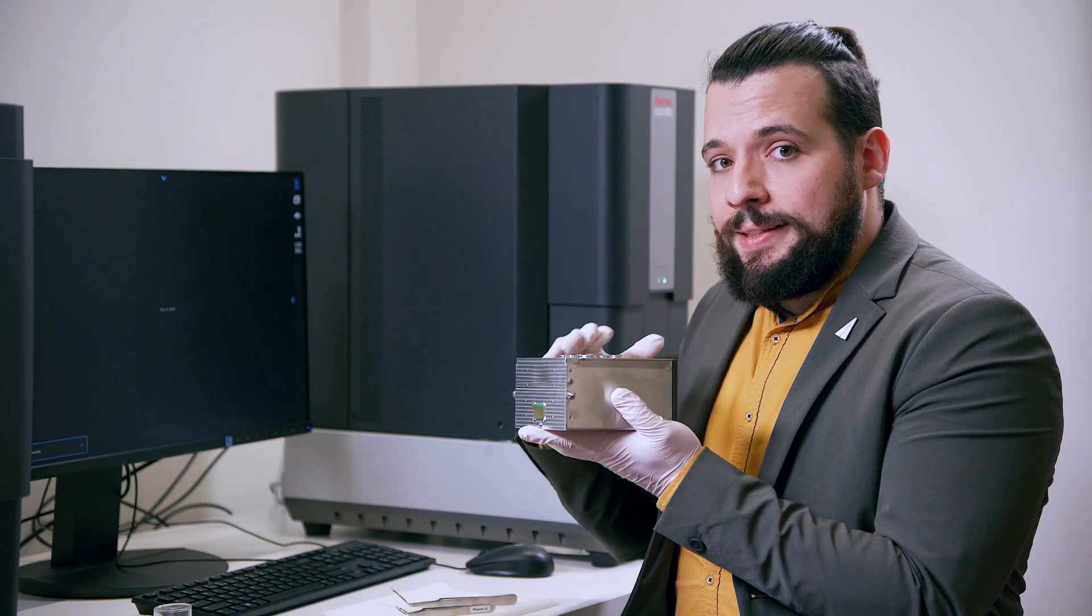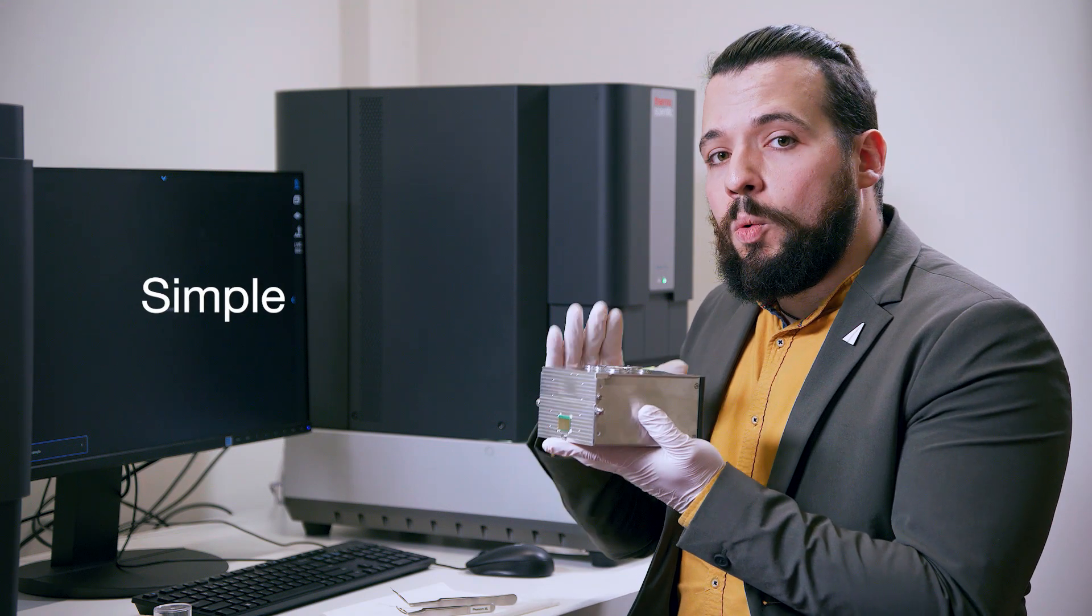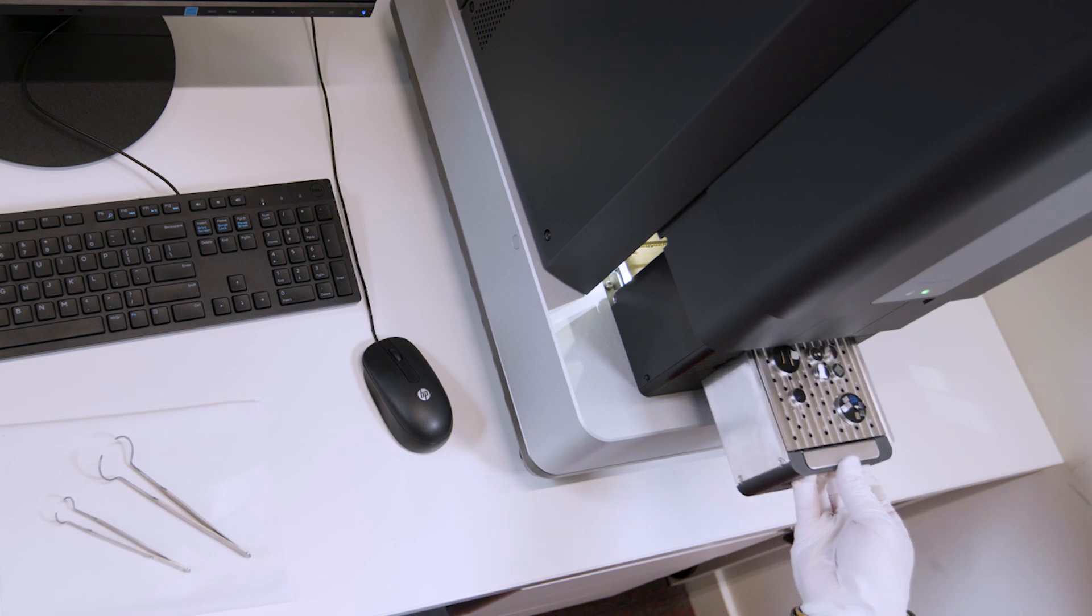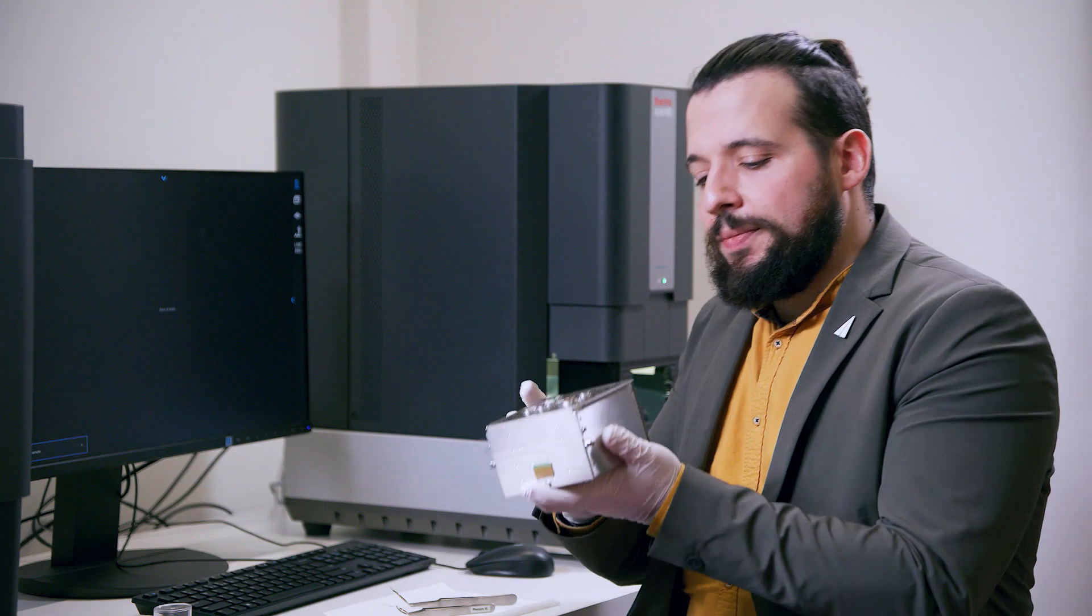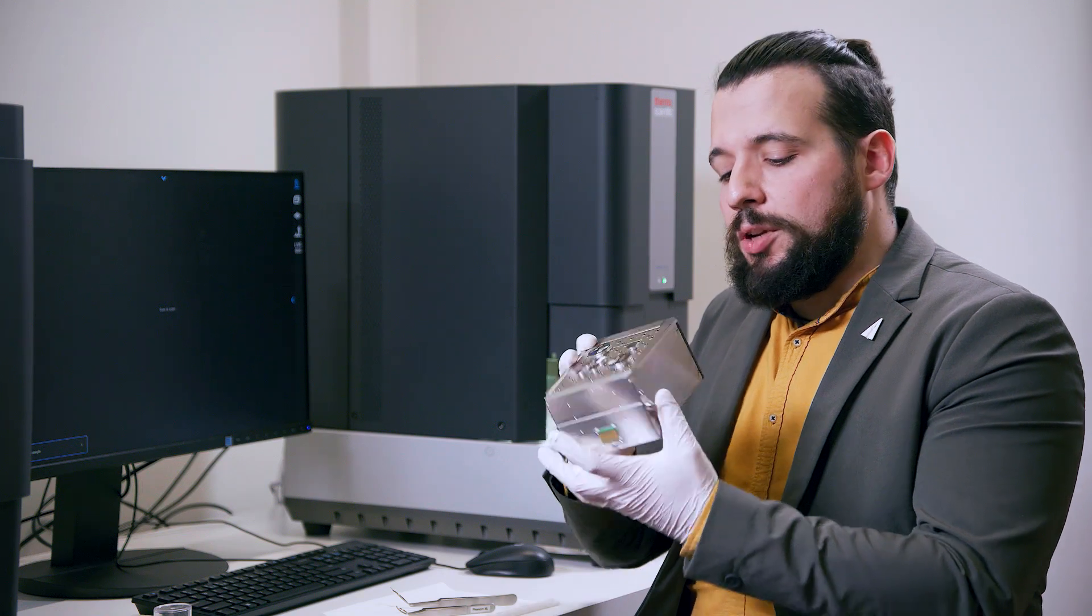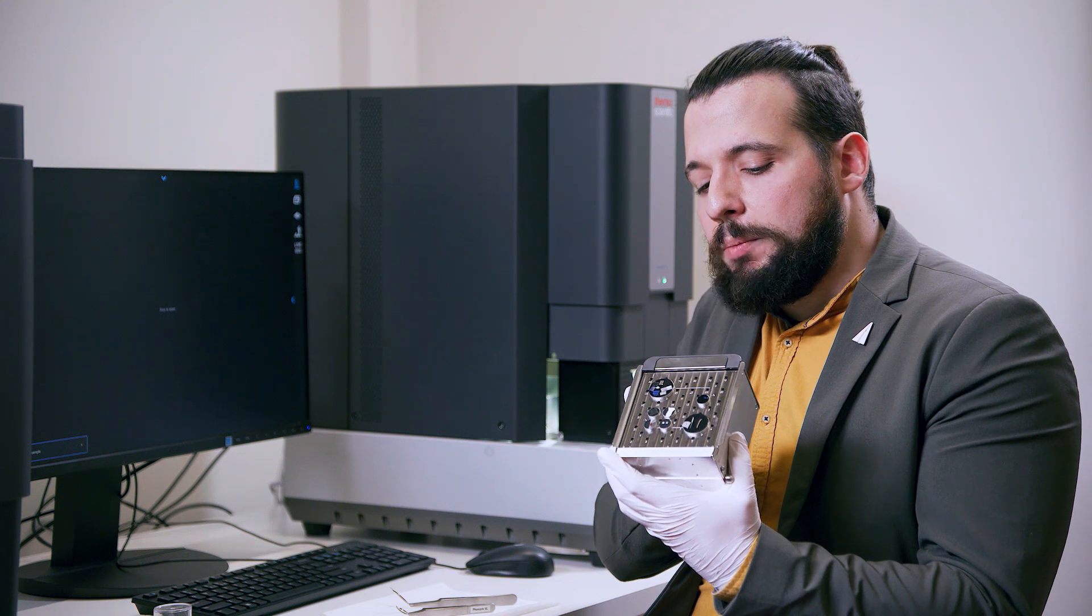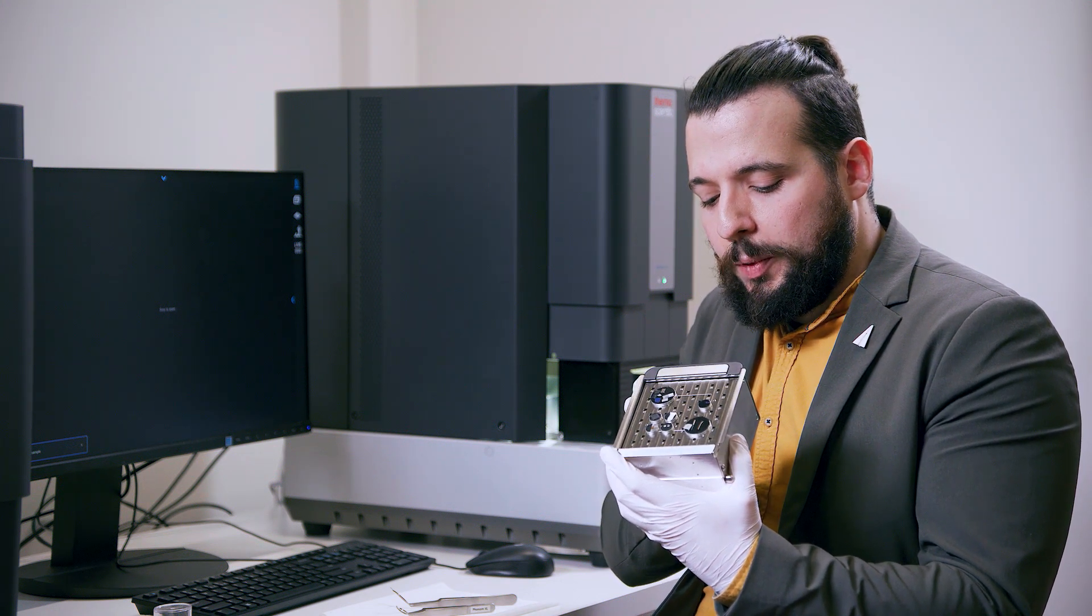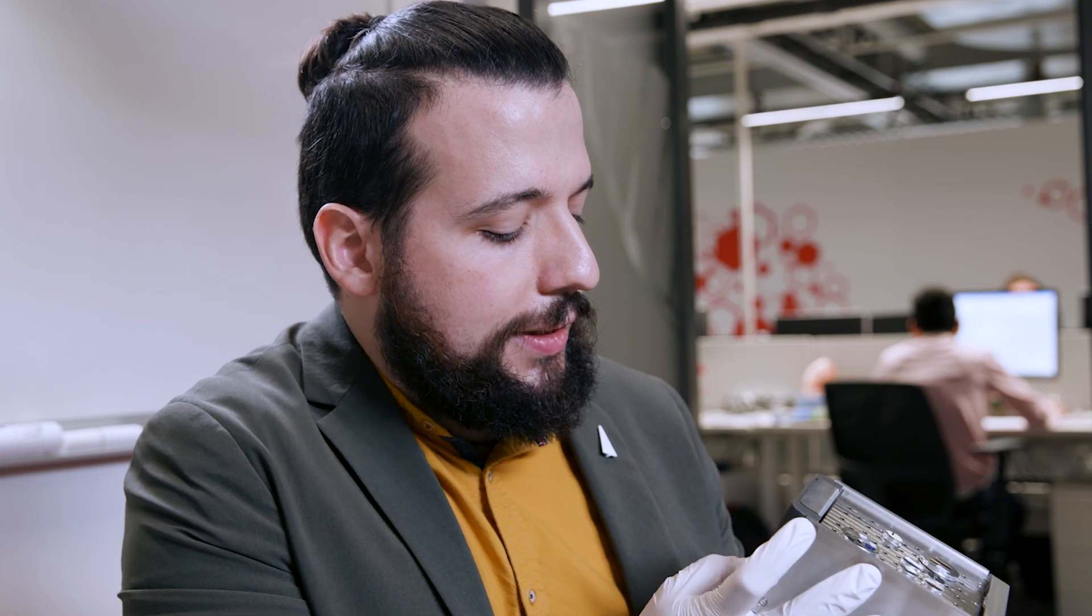The sample height can be easily adjusted, but if you forget to do so, worry not. The microscope is equipped with a system that will prevent you from loading a sample that might damage the detector inside the tool. To adjust the sample height, you can use the wheel at the front of the tool. One working distance can be used for all the detectors that are inside the microscope, so you won't need to further change it during your analysis.